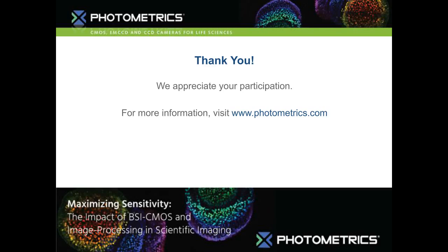The only challenge there becomes with the optics that you're using. At 100x you would be spatially subsampled, and you would need a higher magnification to counteract that. But yes, that's definitely an option. But generally we find that when optimizing for the optics, the 95B tends to be the better option for 100x, while an unbinned Prime BSI tends to be better for 60x.